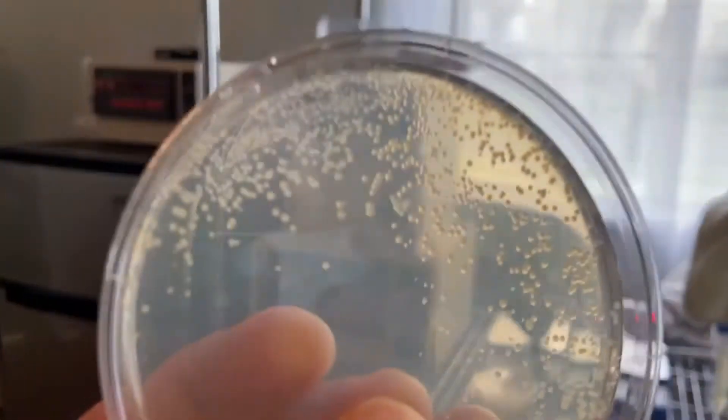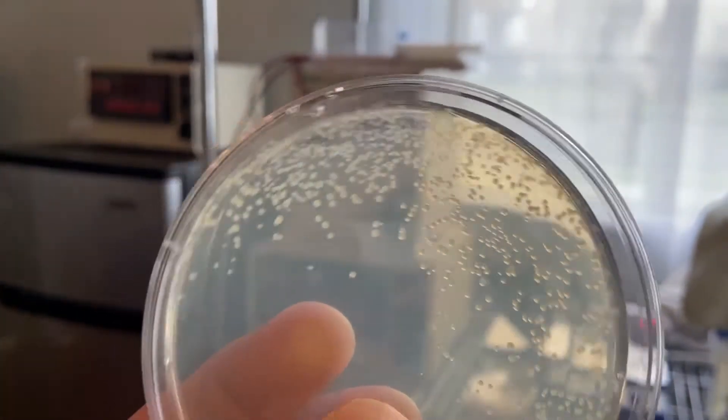Just kidding around. We finally got electroporation working. Let's dive into how we did it.